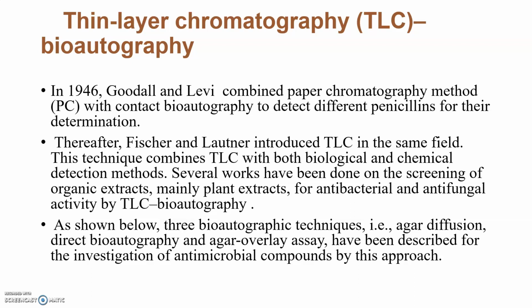Then after those experiments, Fisher and Lautner introduced TLC, thin layer chromatography, in the same field. This technique combines TLC with both biological and chemical detection methods. Several works have been done on the screening of organic extracts, mainly plant extracts, for antibacterial and antifungal activity by TLC or bioautography.